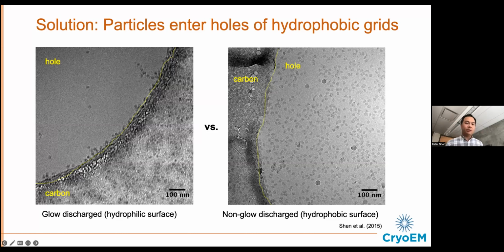And really, this is the spirit of what I think as a field, we should be talking about. What are the anecdotal tricks that people have come up with to get their projects to work? So Jesselyn, I really appreciate that question. But in my hands, I haven't tried positive glow discharge.